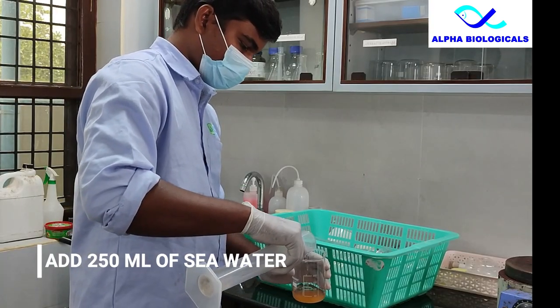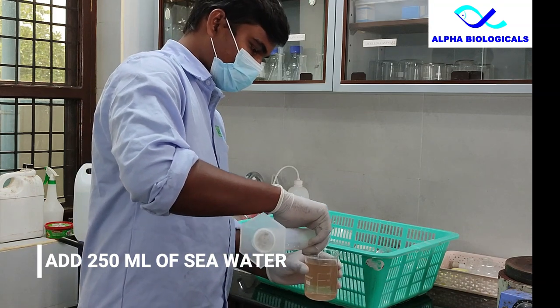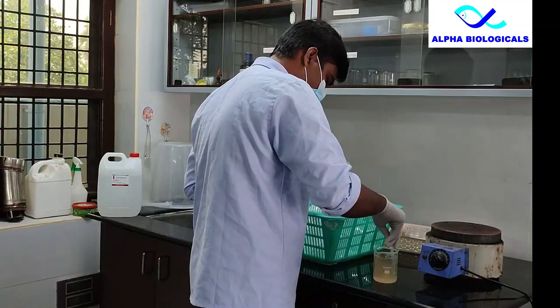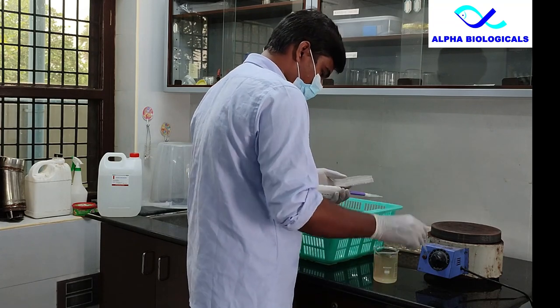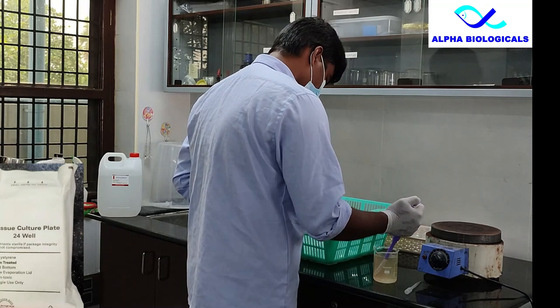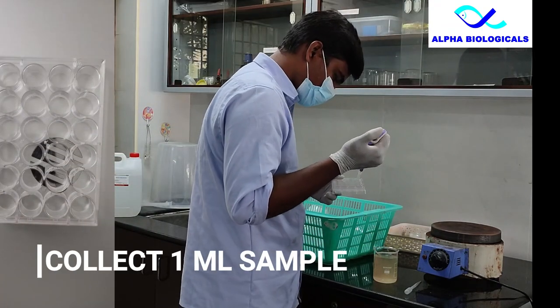To this add 250 ml of sea water. Mix well and collect 1 ml sample with the help of a 1 ml micro pipette, 1000 microlitre micro pipette.